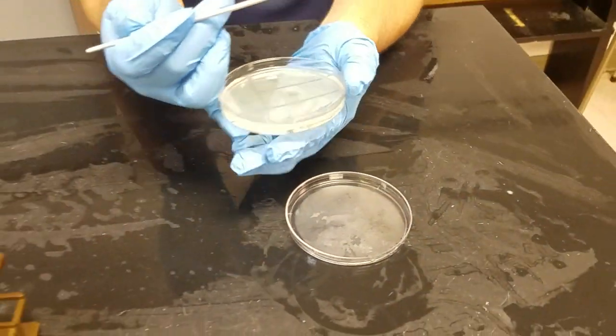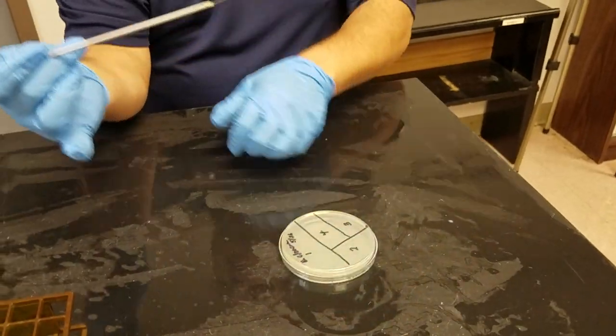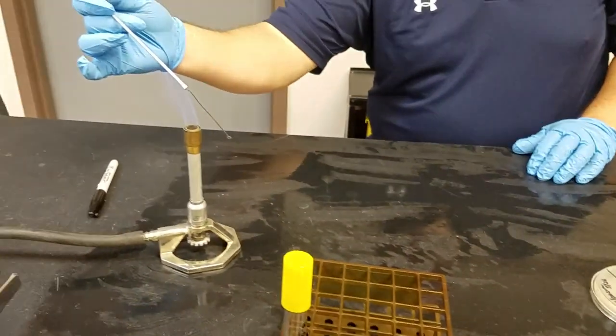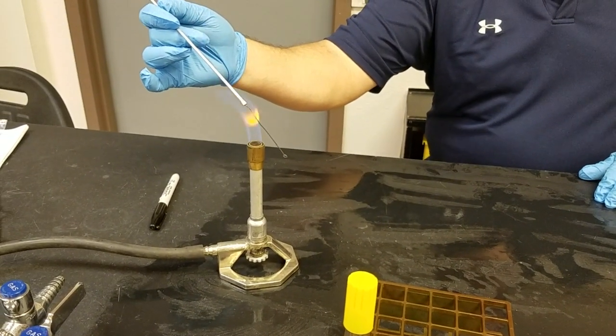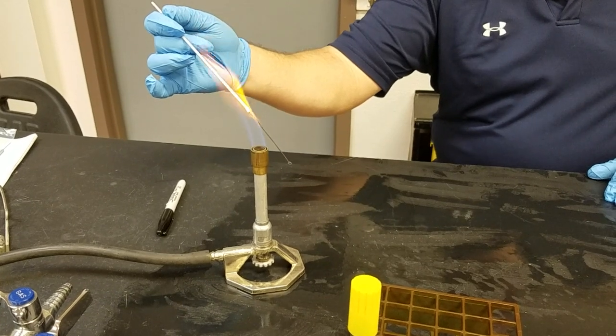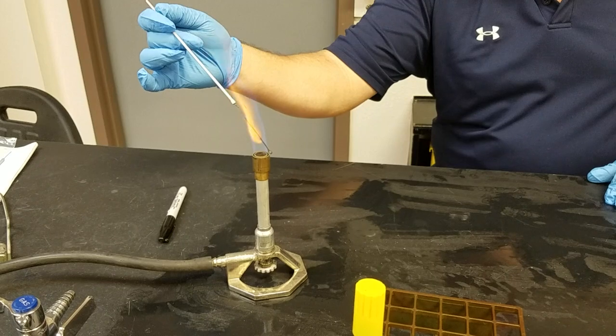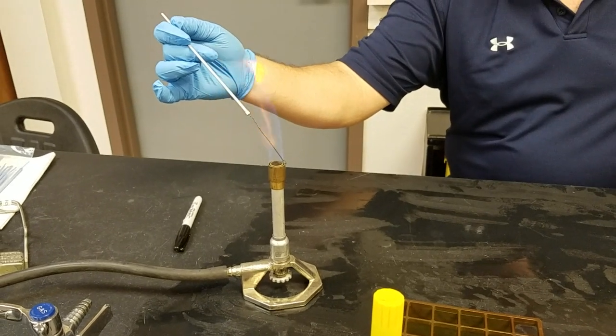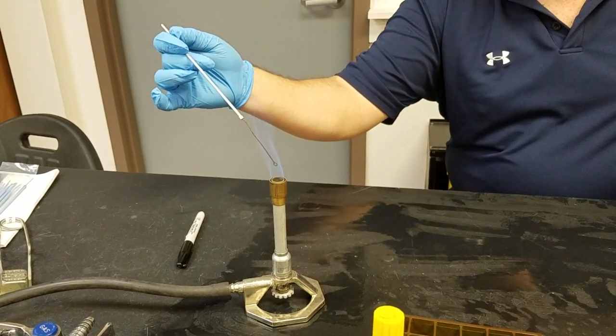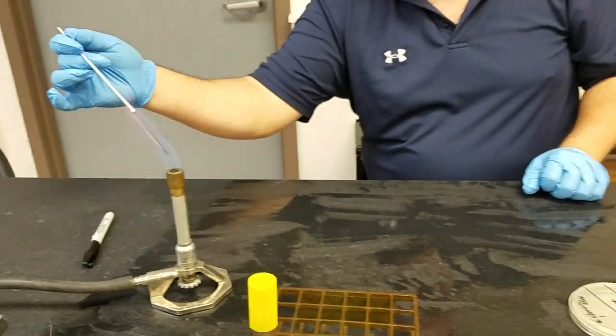Then I'm going to put that down and flame the loop because I'm not interested in the population on that loop - I'm only interested in the population of microorganisms that I have placed on that plate.